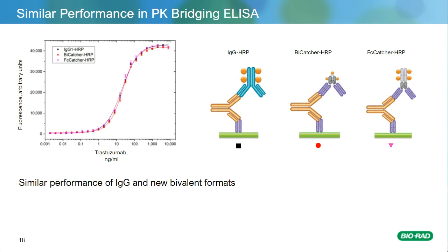Another thing this diagram shows is a comparison between the different SpyTag formats of the Fab antibody versus a classical mammalian expressed IgG version of one of our recombinant antibodies that was generated through cloning into a mammalian expression vector. Essentially what you see is the SpyTag versions give very good equivalence compared to the classical full IgG version that we used to make.